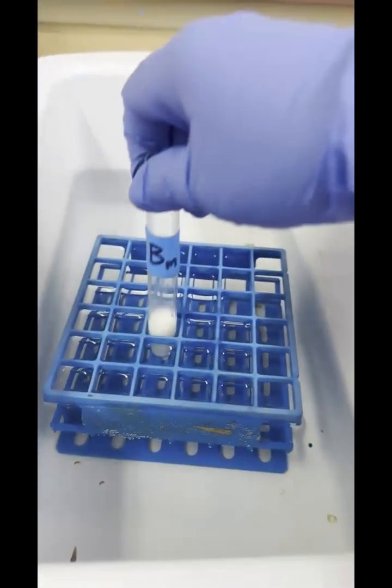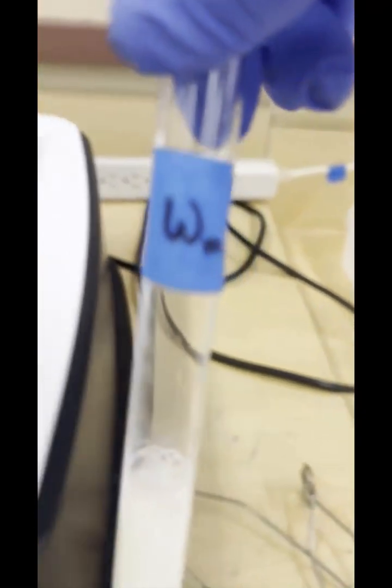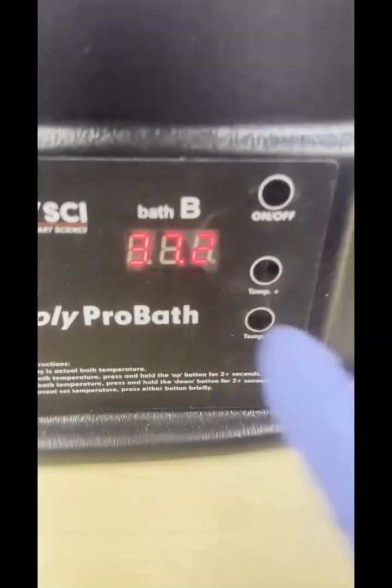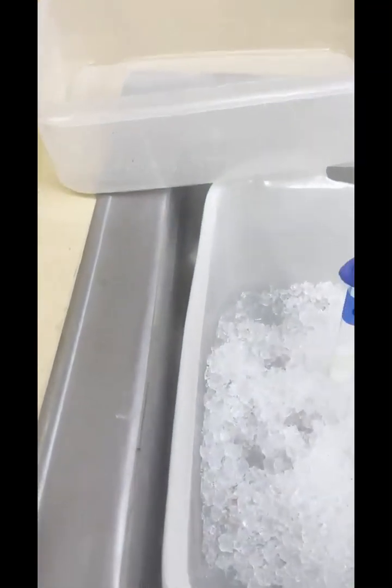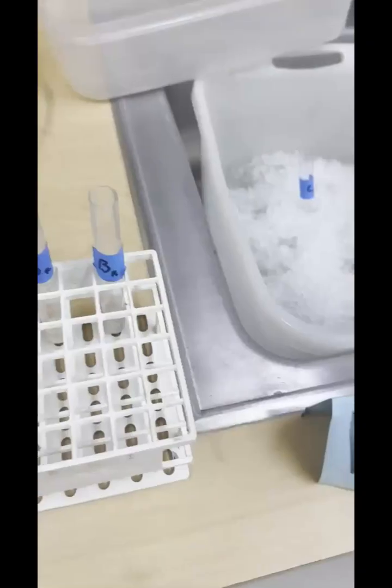So for the boil, it's going to go in 37. The warm is also going to go in the 37. And then the cold is going to go right there in the ice bath. Okay, and we're going to wait 5 more minutes.